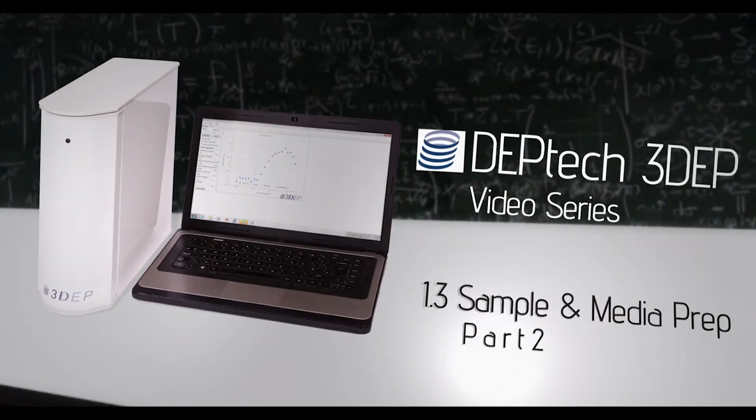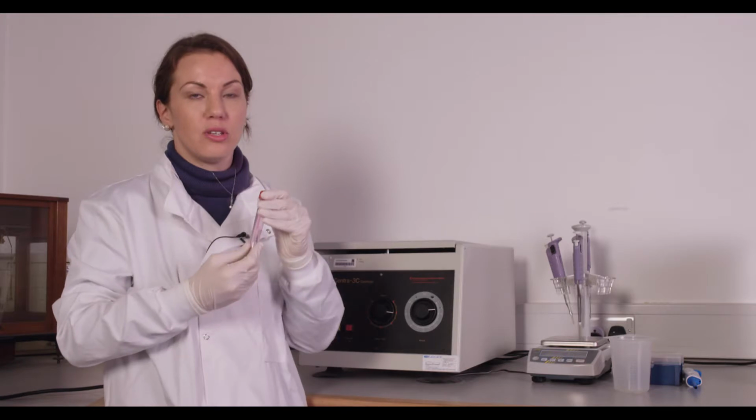When preparing your cells for your DEP experiments, the first thing you're going to want to do is get your cells into suspension. In order to do this, if you've got an adherent cell line, you'll use whatever protocol you normally use to detach your cells to get them in suspension. For a suspension cell type, all you'll do is simply pipette your flask into a tube.